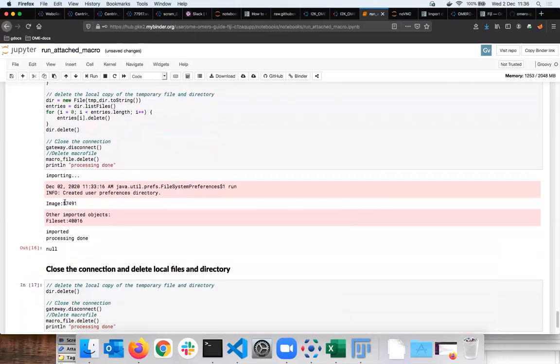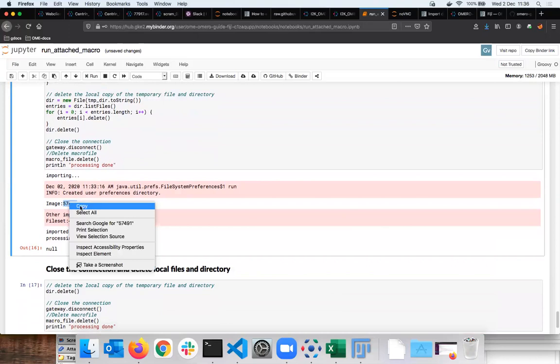And the whole thing was done, and you see how easy it was to analyze an image. And I could have done, of course, in a loop on 414. I didn't have to change a thing, and I have security that everything will work every time I come to it.